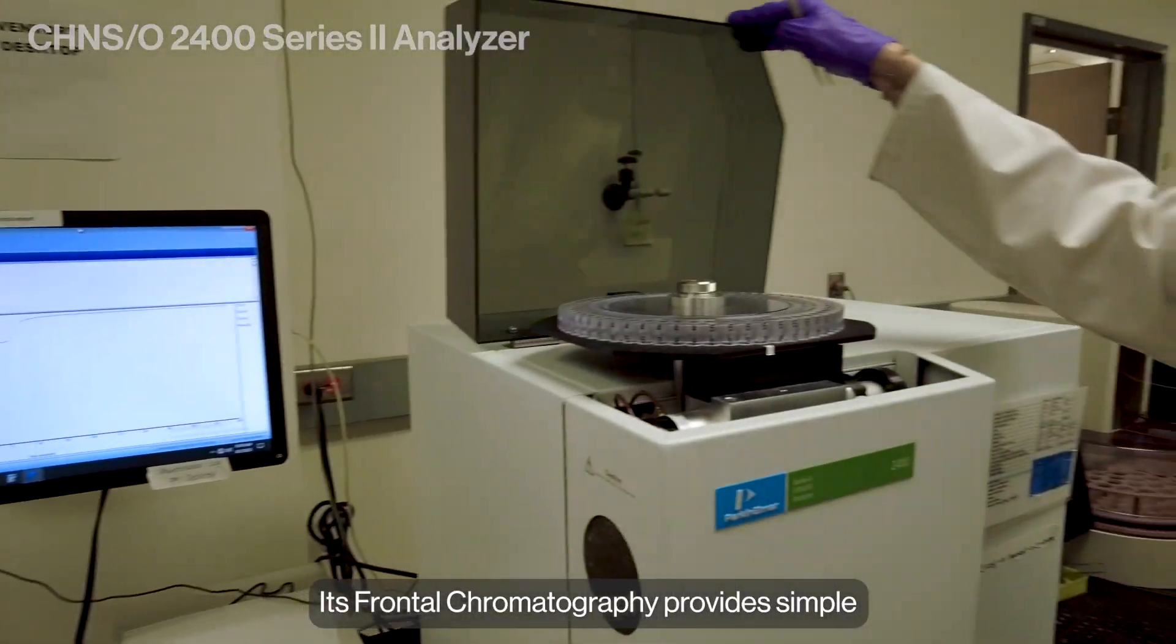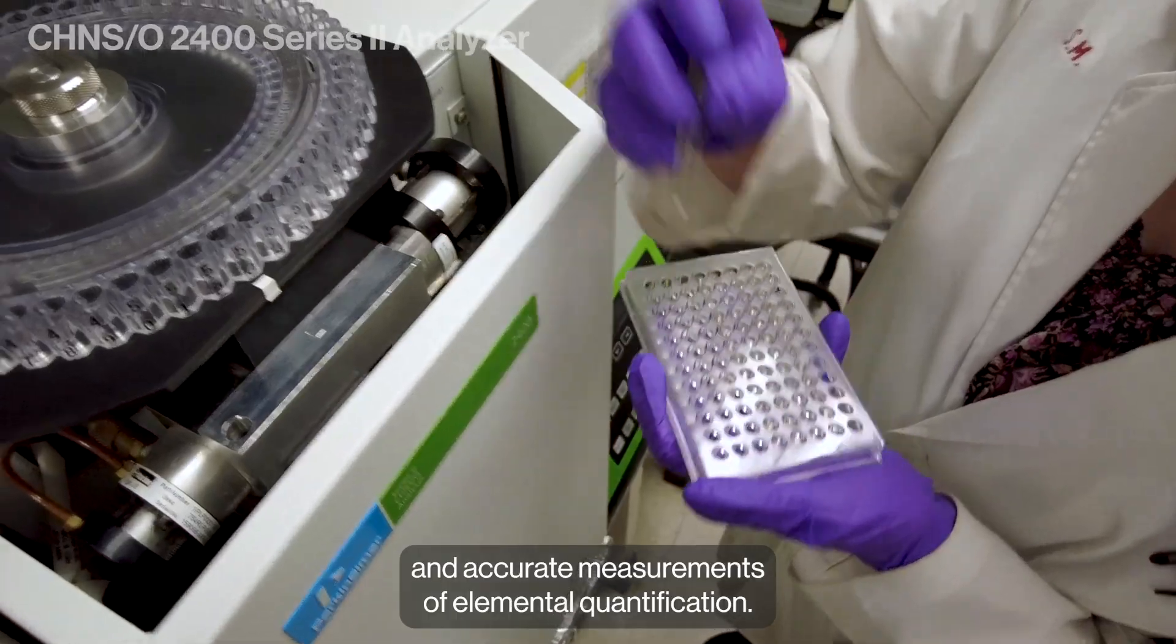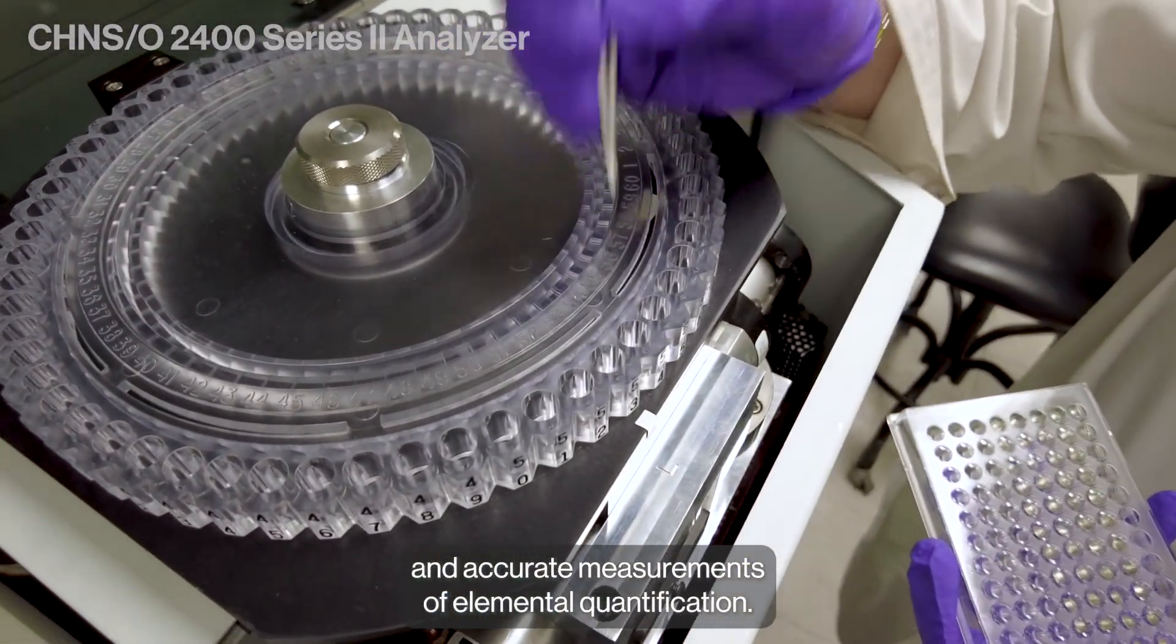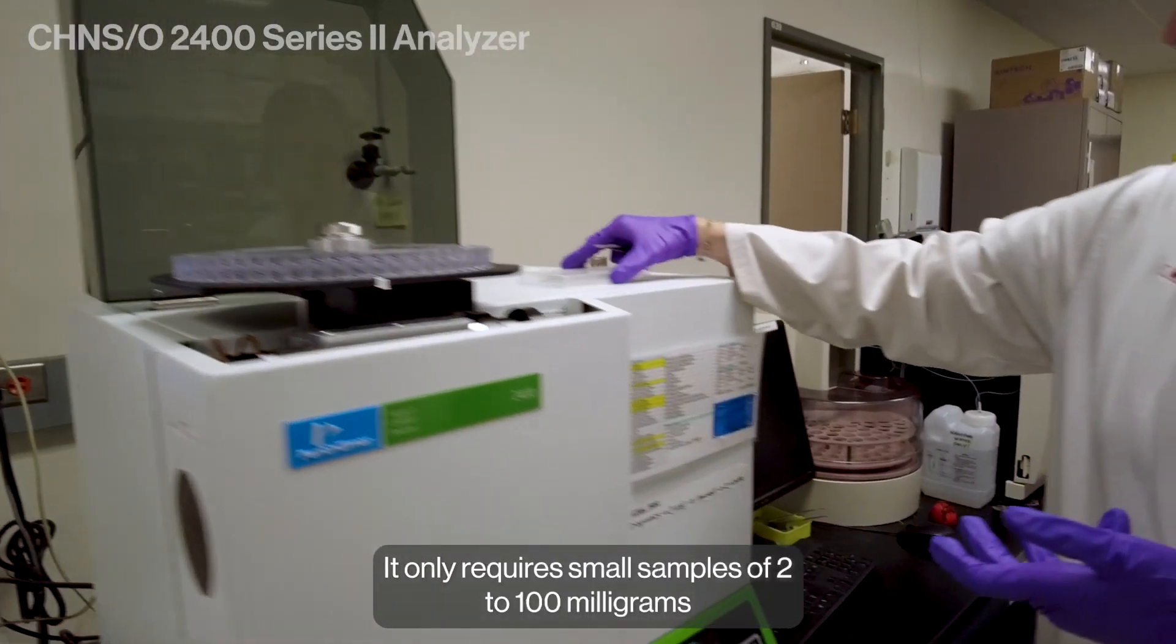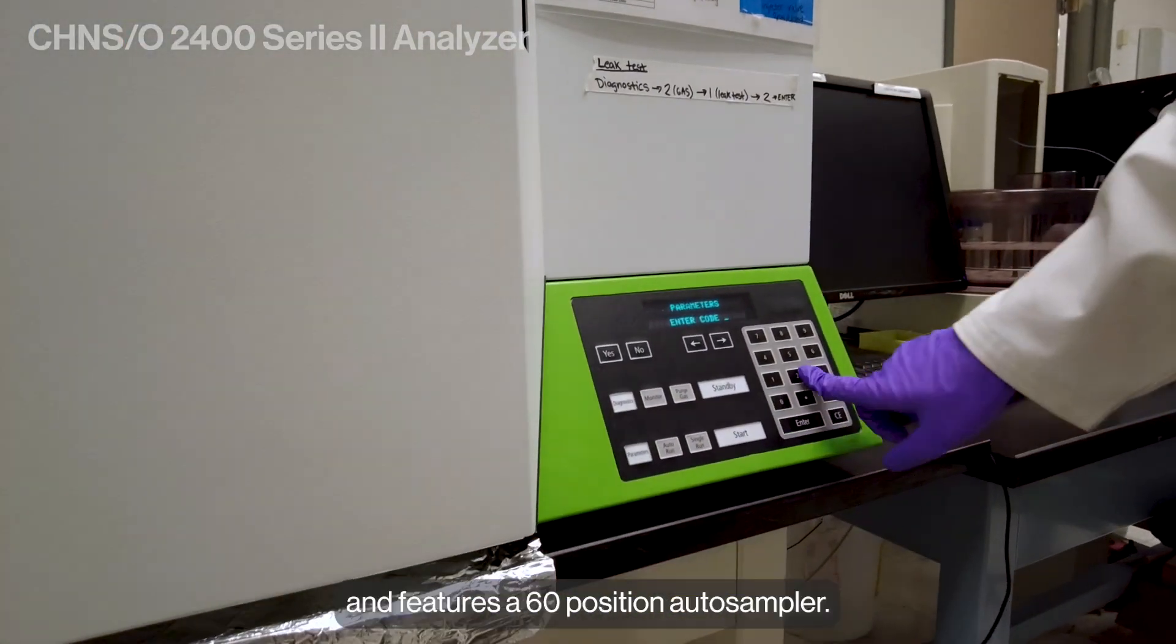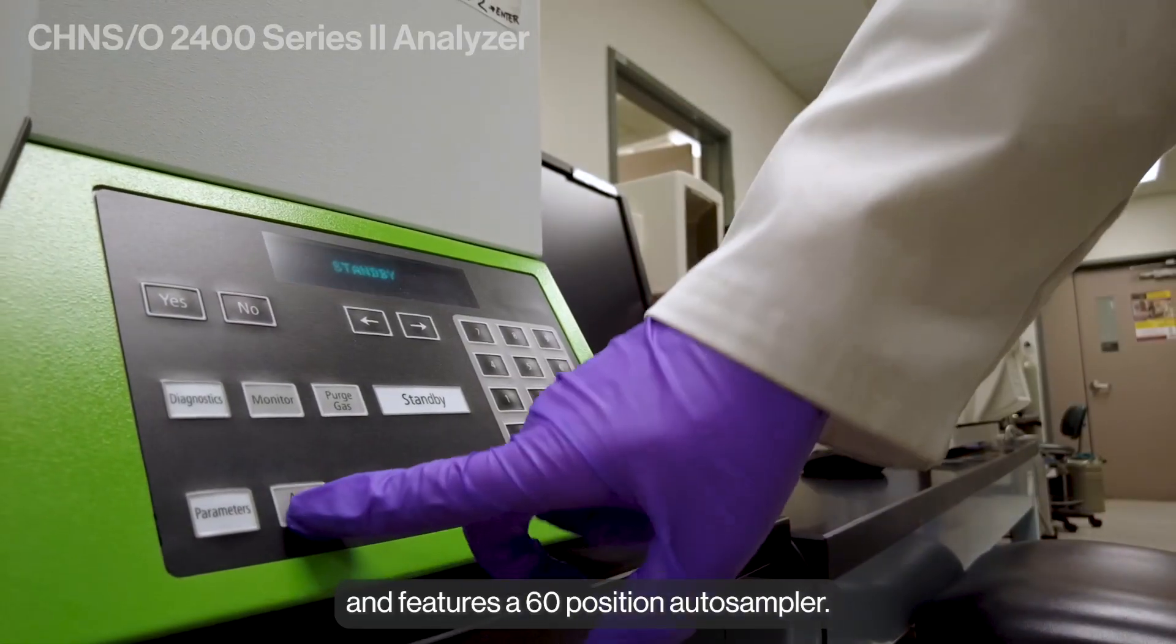Its frontal chromatography provides simple and accurate measurements of elemental quantification. It only requires small samples of 2 to 100 milligrams and features a 60 position autosampler.